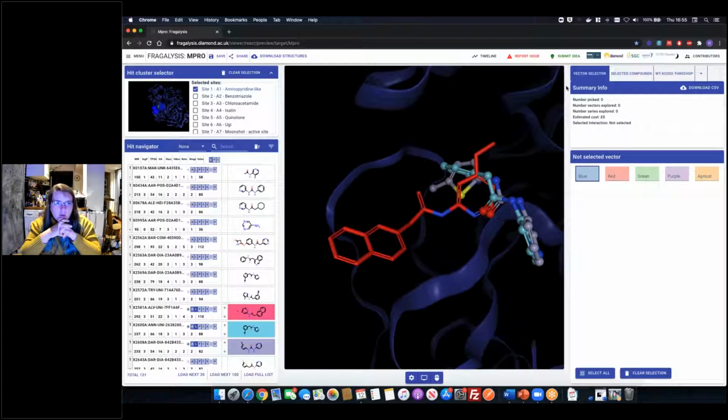So I think if you're looking at bigger proteins, that's where your limitation will be. If you're looking at bigger ligands, I think it would handle them fine. The biggest challenge in the ligands themselves is pulling them out of the proteins in the first place. So when we upload the data, we separate the ligand out completely from the bound state PDB file.